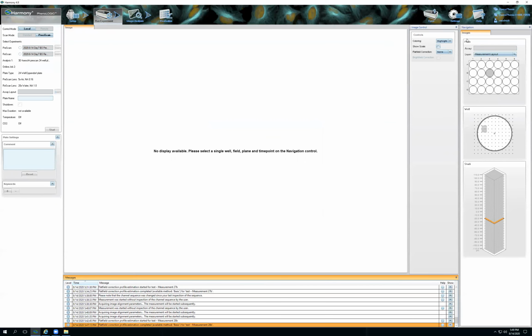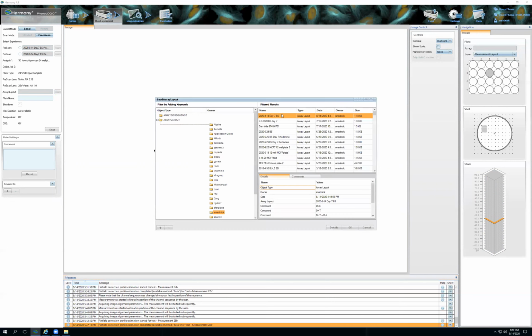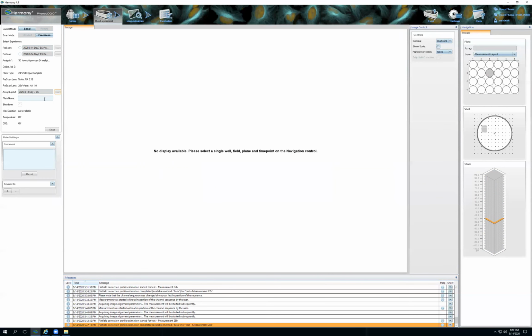So here, you can test it again to see if you're happy with the change in your red. I'm not going to keep going through it, but as you can see, this is a general idea of how you would go through the process of finding your spheroid in the 5X, having an analysis sequence to detect the middle slice, which will then determine where your 20X objective is going to image from.